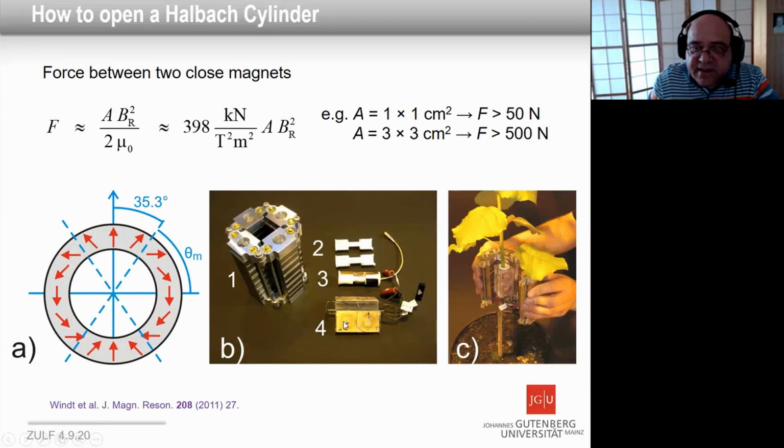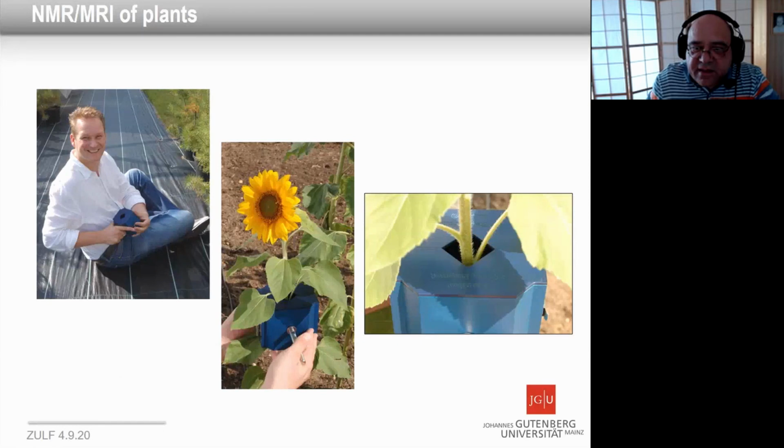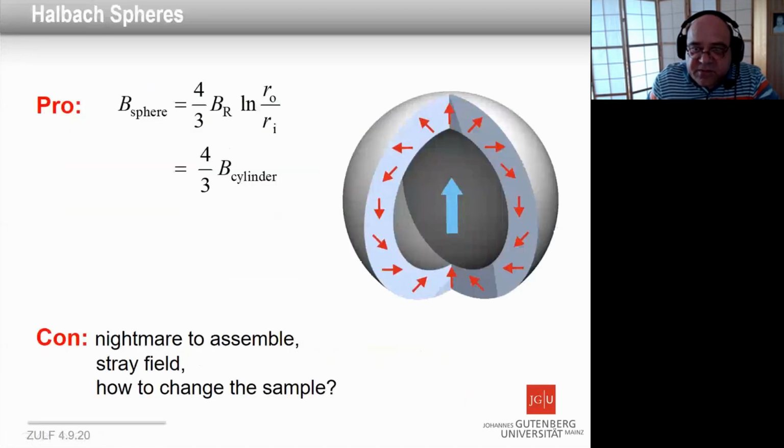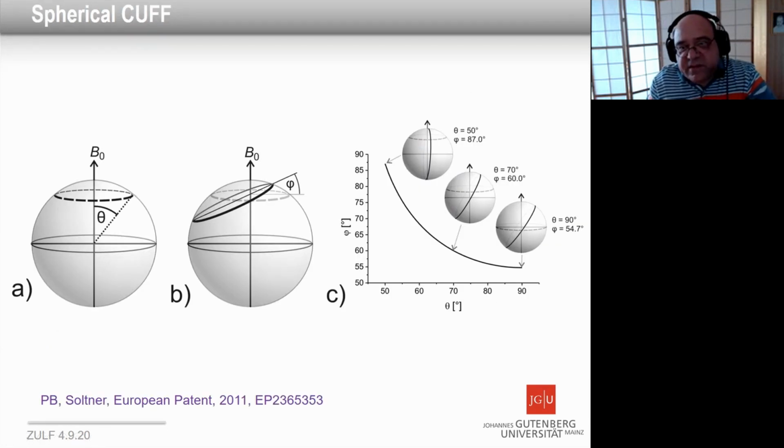So we could build structures that open and close, and you can put it around a plant, do imaging, measure flow, measure the water uptake of this plant during light and dark periods, and study that. So that is nice, but it becomes really handy when you want to use this structure, because it is not only a nightmare to assemble, but also it has a problem once you build it, how to access it, because it's all surrounding the sample. Well, you can open those as well at certain angles, which are a continuous kind of feature of this. So you have various options to open it at different thetas, at different phis. So there's the solution for that, theta versus phi.